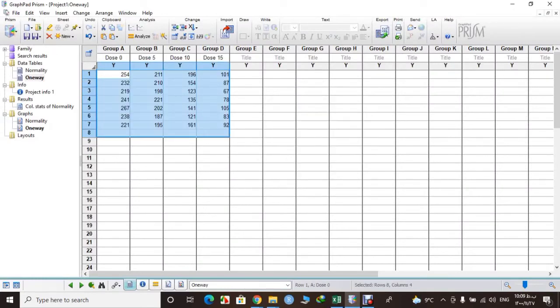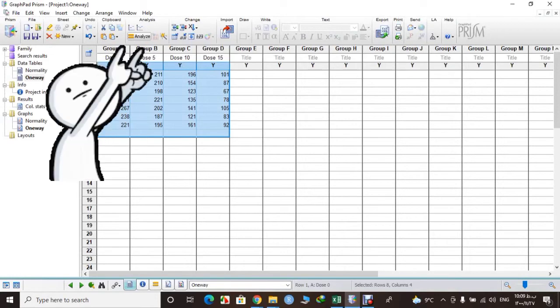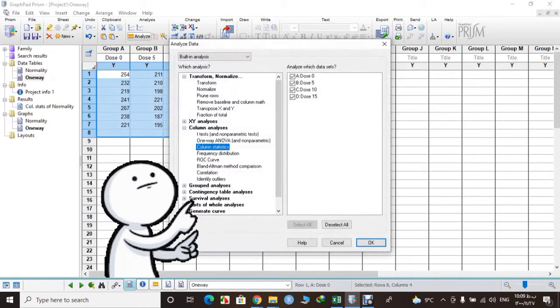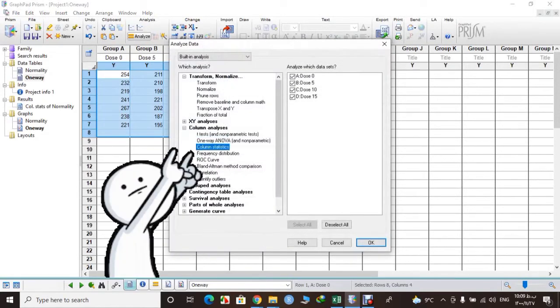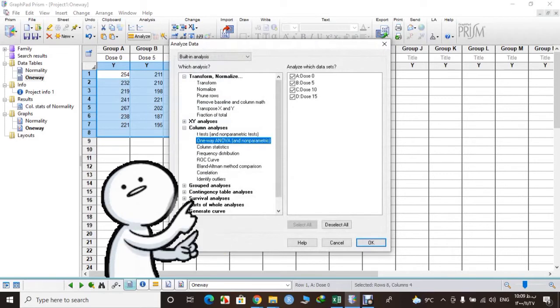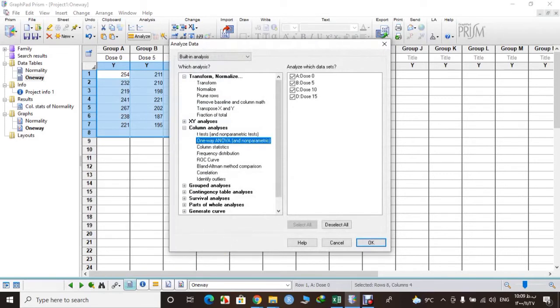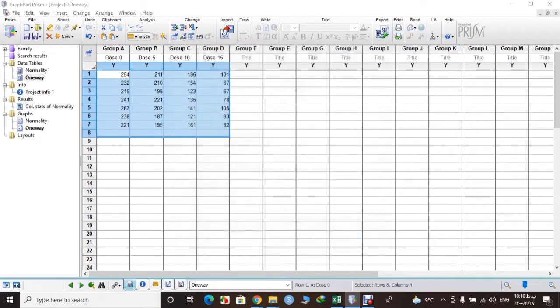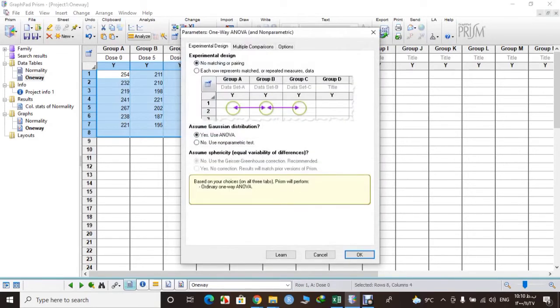Now what you need to do is select Analysis and select one-way ANOVA. Check that we have all our four data here that we want to analyze.